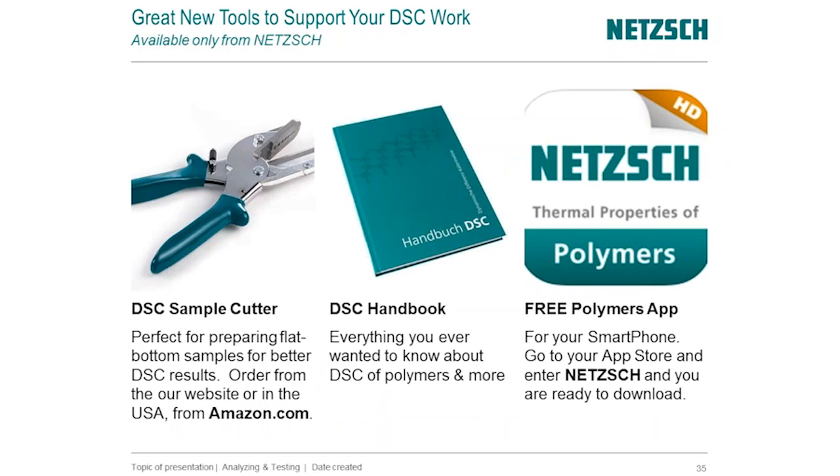All right. Other new tools that I want to mention to support your DSC work that are available just from Netz. It doesn't matter which DSC that you're using, but this tool is available from Netz immediately. It's called the DSC Sample Cutter. It's very important in DSC that your sample have good contact with the bottom of the pan. Remember the heat flux sensor, you've got the thermocouple type set up directly underneath the bottom of the pan that we saw in the very beginning. You want to have as uniform, as even distribution of your sample on the bottom as possible. So a nice flat preparation.